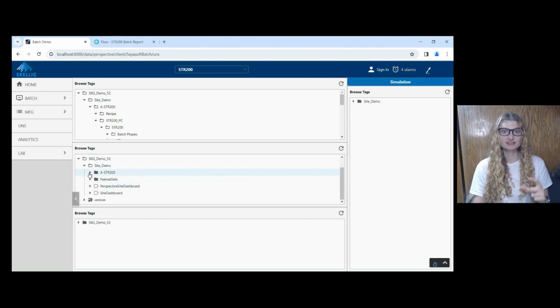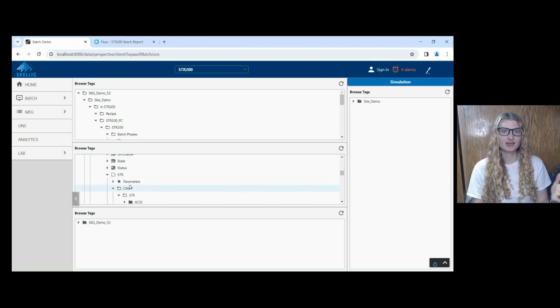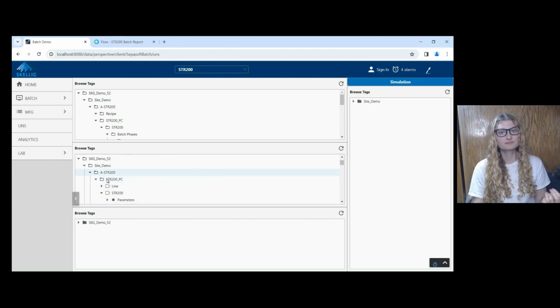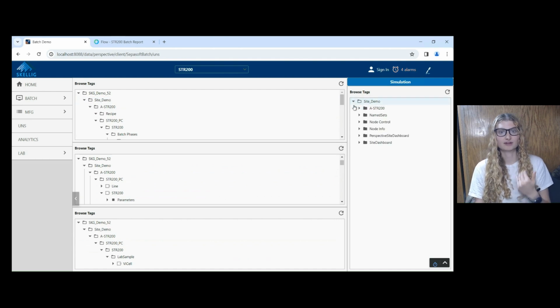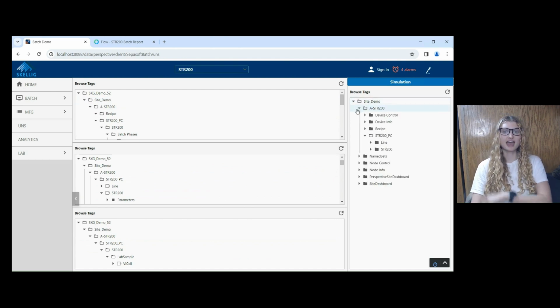The one in the middle is our traditional Ignition engine, so it has all of our CMs, EMs, and some stuff for visualizations. And then down here at the bottom is our lab digitization, lab sampling data. And all it knows is stuff about the sample. Now what's happening is all three of these are publishing to my master broker. And if we expand the one on the right out, you can see that it combines everything.